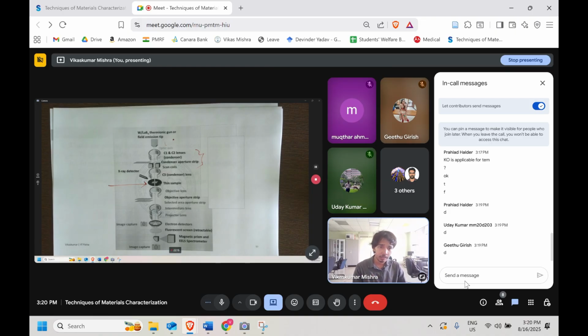The interaction can be elastic, it can be inelastic also. In the majority of cases, we try to avoid inelastic scattering in the TEM. That's why we are limiting to thinner specimens. Now, let's say the interaction is elastic. Since it is elastic, the electron beam is going to interact with the nucleus, and so it can change its trajectory.